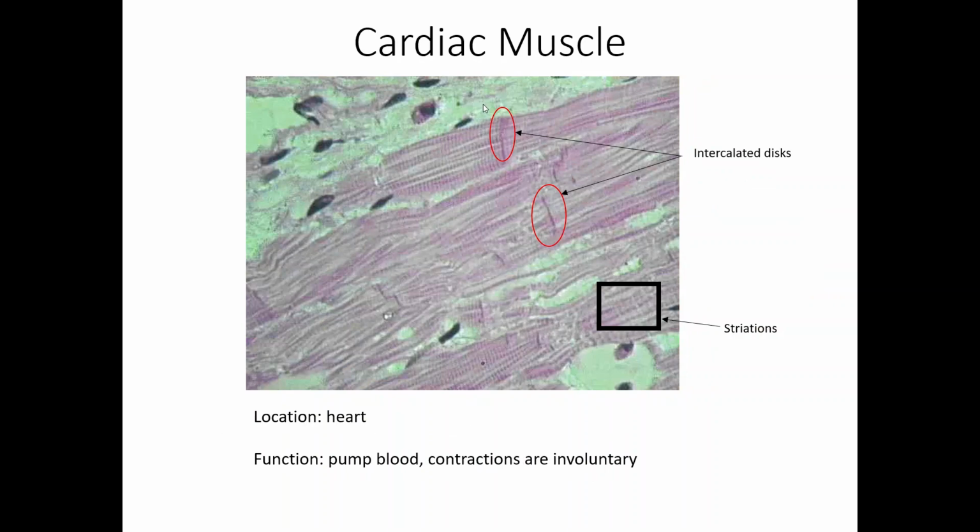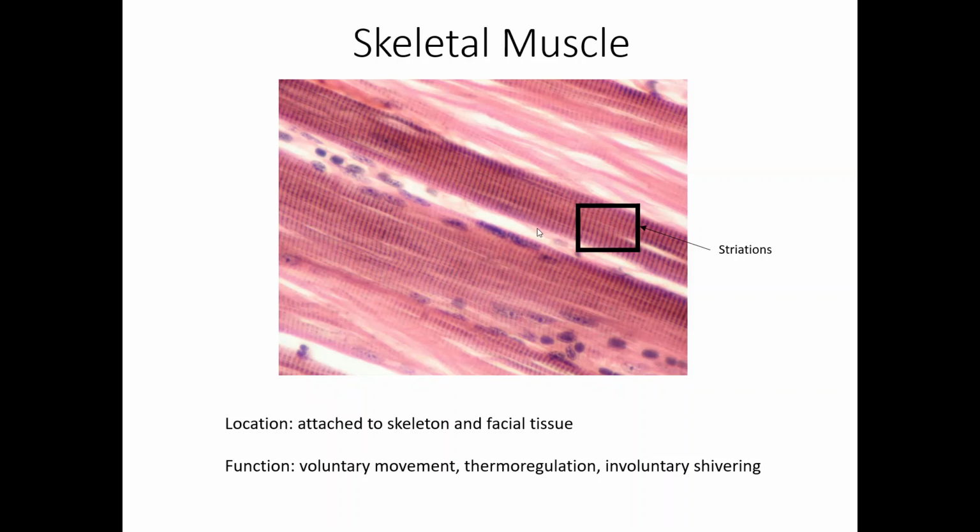Cardiac muscle, we've got the intercalated discs that we're going to take note of. We can also see the striations, the stripes here. It's a little difficult to tell that these are branched cells, but all of this extra space that you see is from those branch points. But those intercalated discs, that's our giveaway that this is cardiac muscle, because skeletal muscles just don't have that.